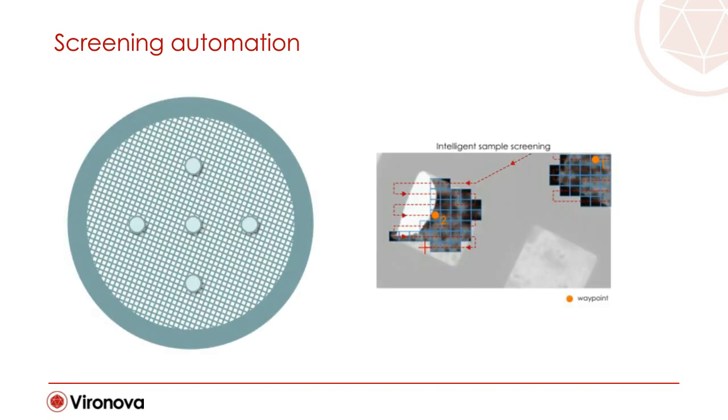I'm now going to guide you through the automated procedures in which the system works in order to collect and provide meaningful and accurate data of a sample. And we're going to discuss how this data and output can be representative for the sample and ultimately the product being analyzed. On the slide, you see a representation of a standard 3.1 millimeter grid, which is used to place the sample upon and subsequently mounted into the instrument.